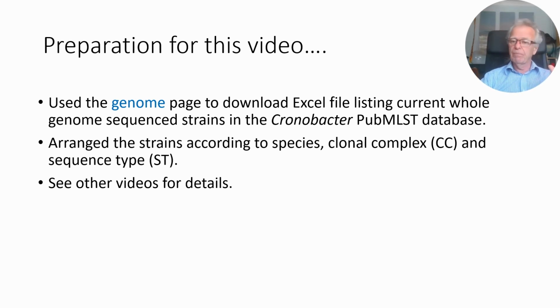There are various videos I've got on YouTube that you can go to if you want more advice on how to do that. This is simply my example. You might well want to be more restrictive and choose a particular country or particular year range or sequence type, etc. This is simply what I did in order to prepare for this video.